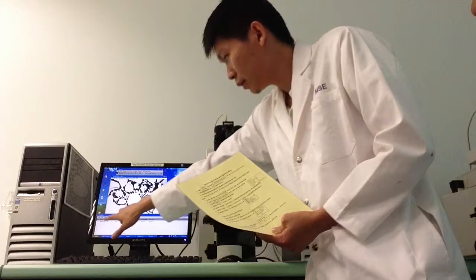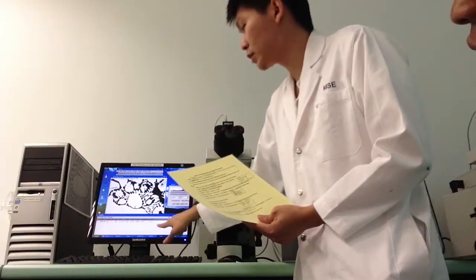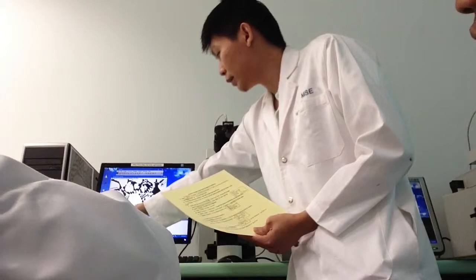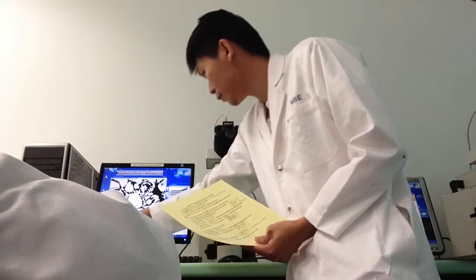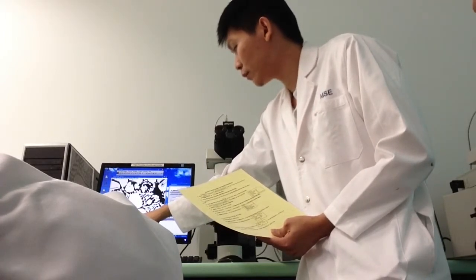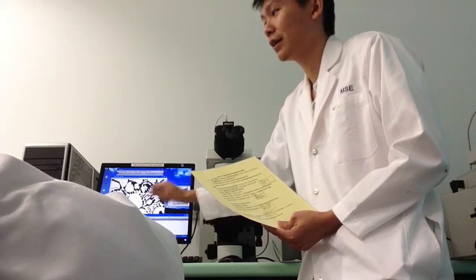Step number 14, this is for the lab team. Out of all those values, you only need two sets of values, which are the area and the percentage area. What we mean by the area is this area, which is 5095, the area of the yellow box. Then the percentage area, 21.569, is the percentage of black region inside the yellow box.